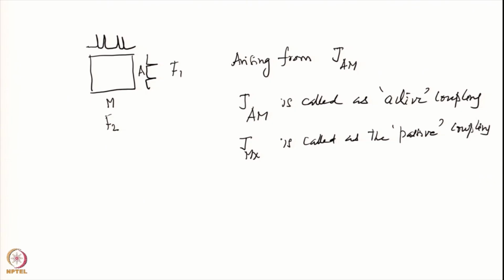Okay. So now if I want to write the splitting pattern of both the spins A and M, suppose I have this A chemical shift here and this splits because of the AM coupling, as in the case of double quantum filtered COSY or the COSY, and this produces inside there, because of the active coupling, plus and minus. So therefore inside here there will be pluses and minuses.